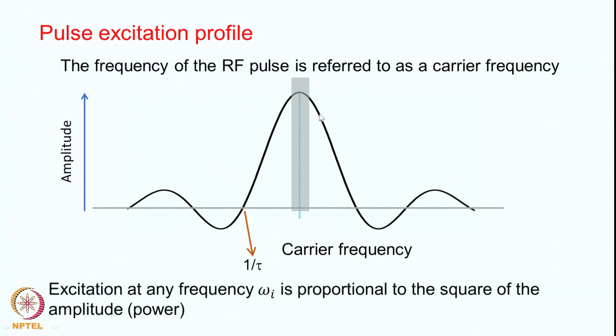And for example, we indicate here, if this is the region of excitation, the region of your interest, and here it is omega naught, this is my omega naught. So this is the RF frequency, and around that RF we take a small region here, and this small region will have similar amplitudes, because if I want to excite the various spins to the same level, then I must have the same power applied to all of them. Therefore, we choose a small area here, and this is achieved by what are called filters, which I mentioned in the previous slide.